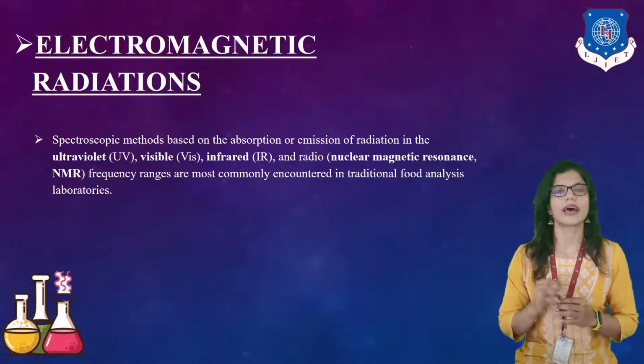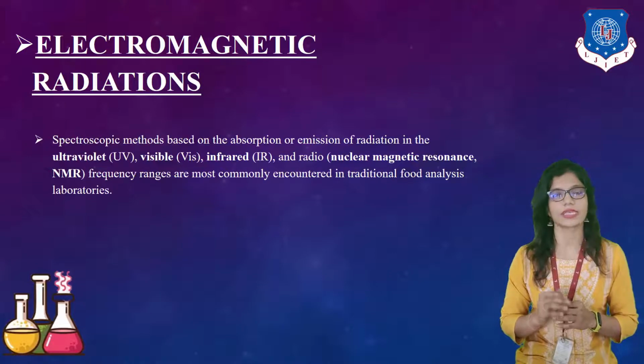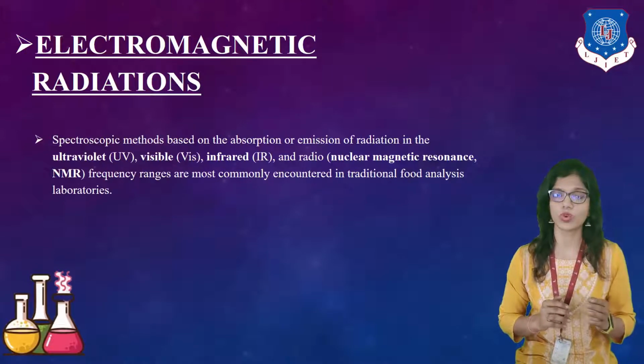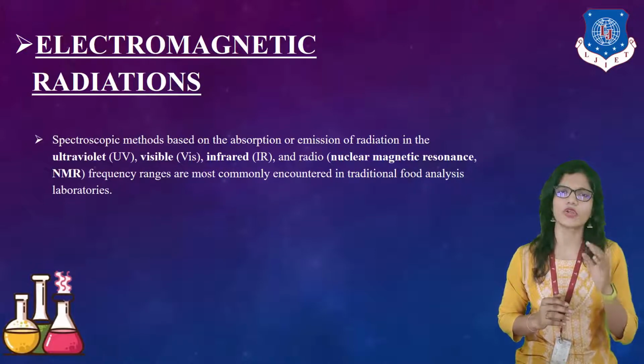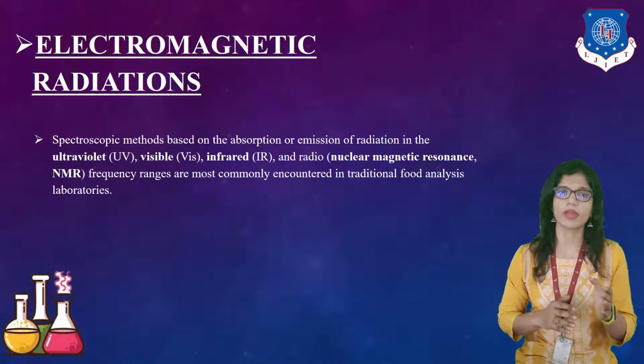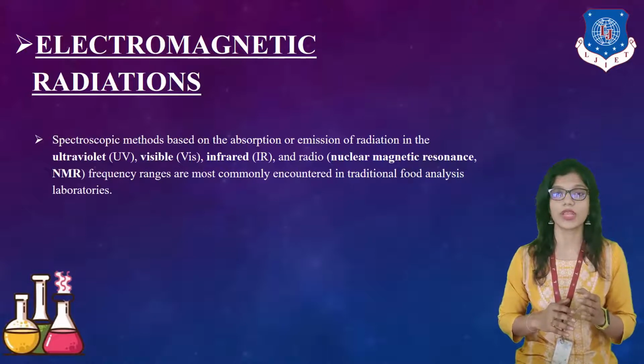These techniques are widely used in each and every field. For example, it can be the food industry, the chemical industry, the pharmaceutical industry, and even a petrochemical or any normal R&D lab, right? You can use it in the petrochemical and fertilizer industry, etc. Nowadays it is most widely used in biopharmaceutical industries.